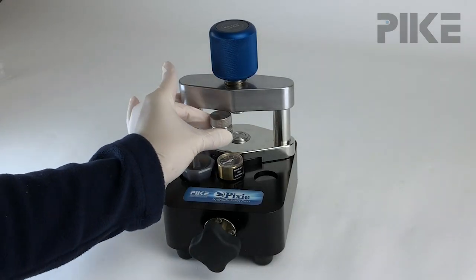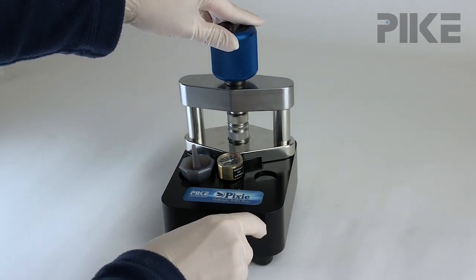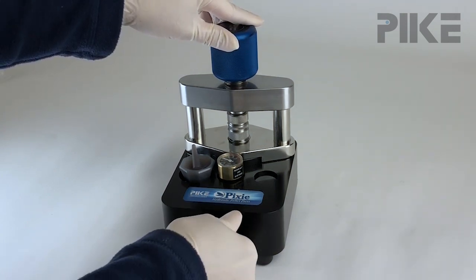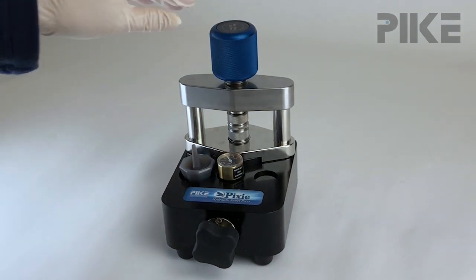Once you prepare your KBR sample mix, all you need to do is put it in the press, turn down the top knob, and then simply crank up the pressure. You can monitor that pressure on an integrated pressure gauge. It's so easy to use that anyone in the lab, regardless of hand strength, could easily make a pellet.